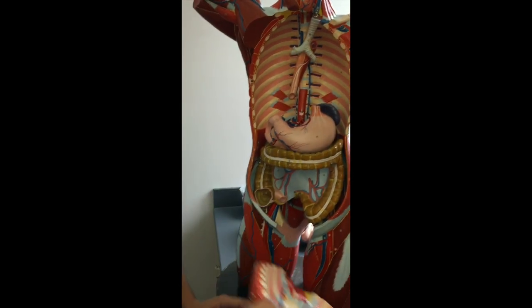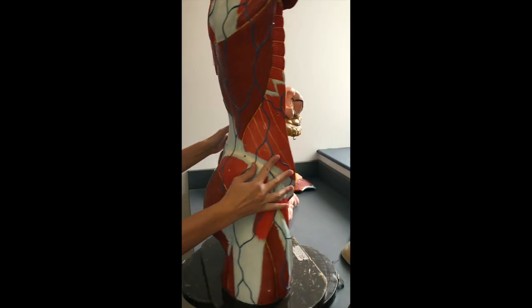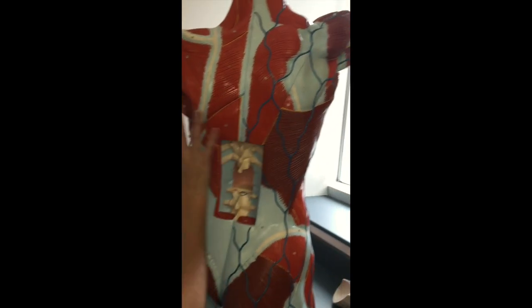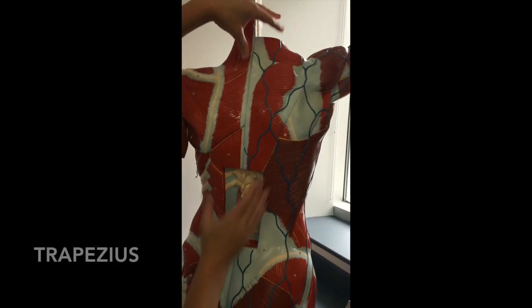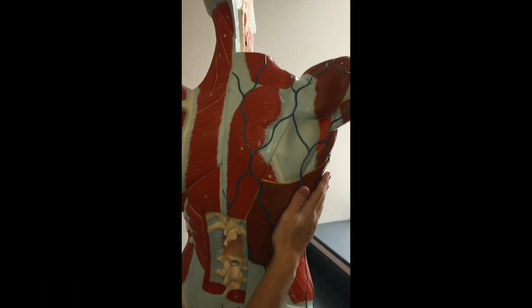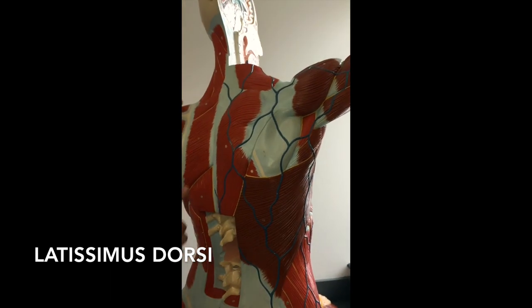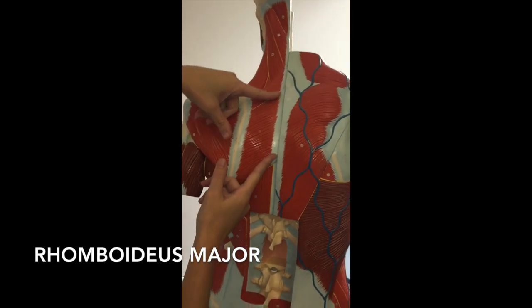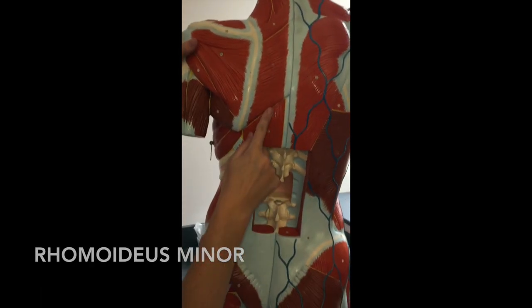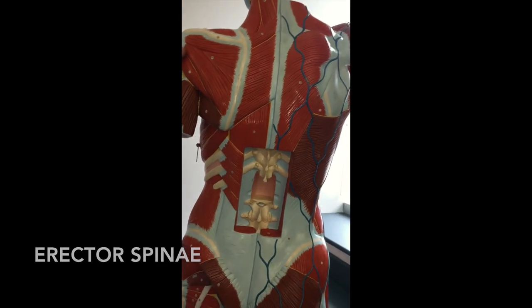Everything else you need to see is going to be on the back. In the back — remember this is the superficial side, this is the deep side — we have our trapezius muscle, this big triangle-shaped muscle here. The lower one here is going to be your latissimus dorsi. If we rip the trapezius off, we have the two muscles here and here — the bigger one is going to be the rhomboideus major, the smaller one is going to be the rhomboideus minor. The last one, the one that goes up and down running along the spine, will be your erector spinae right here.